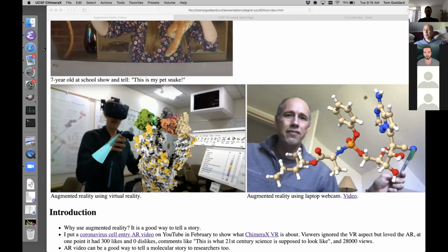Okay, so how did that augmented reality I just showed you work? It used a VR headset. The VR headset was tethered to the Windows computer. It has this cable coming off of it going to my Windows machine. I was using a Vive Pro, but it can work with all kinds of different headsets, like an Oculus Rift S. That's sitting here.